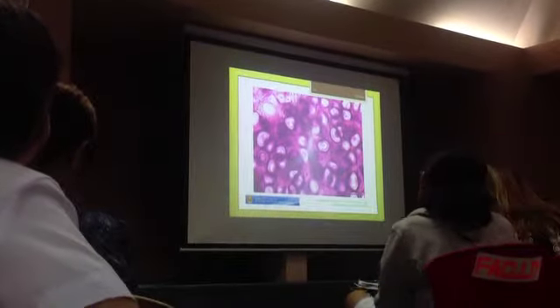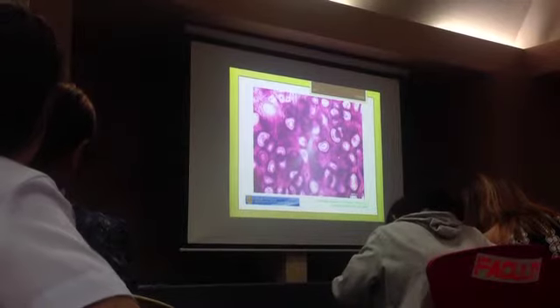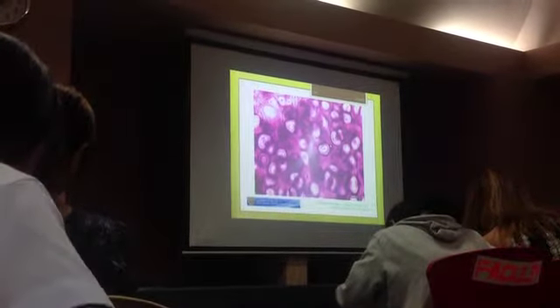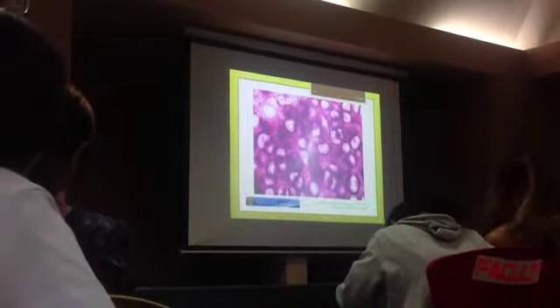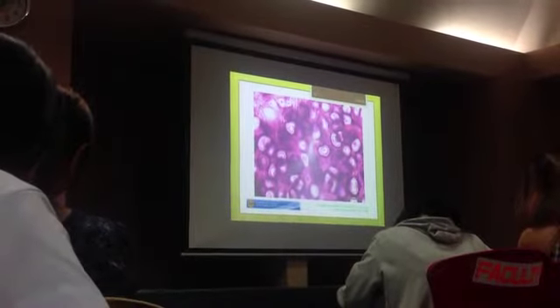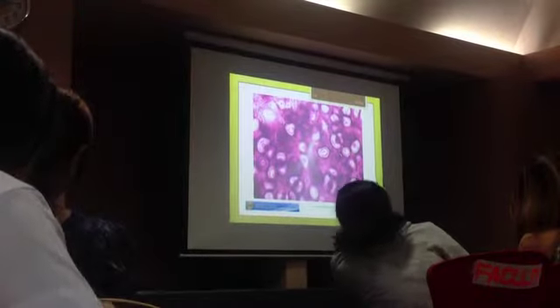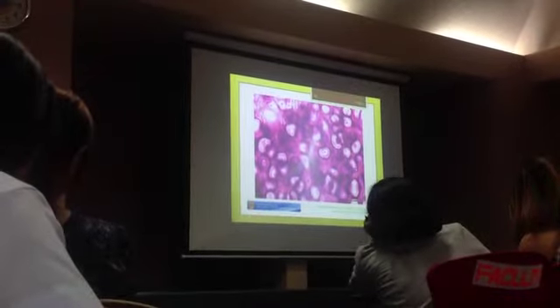Elastic cartilage. In elastic cartilage, you can see elastic fibers, so the predominant fibers are elastic. These are your chondrocytes and lacuna.